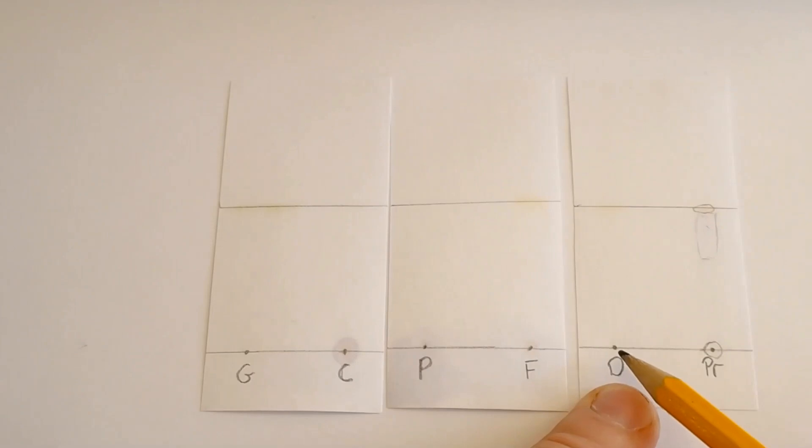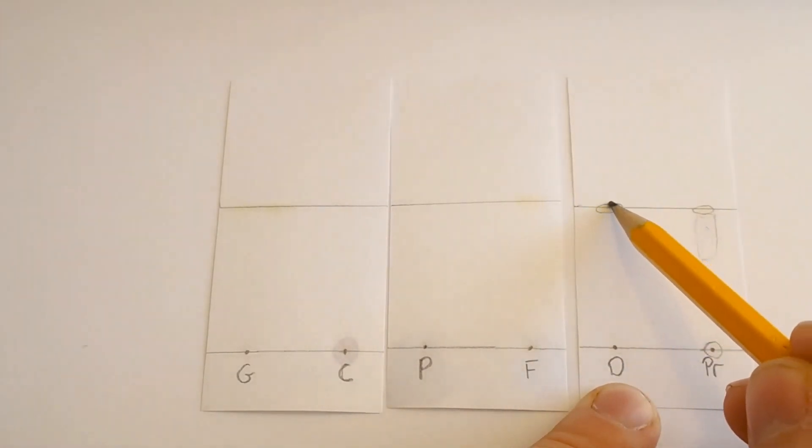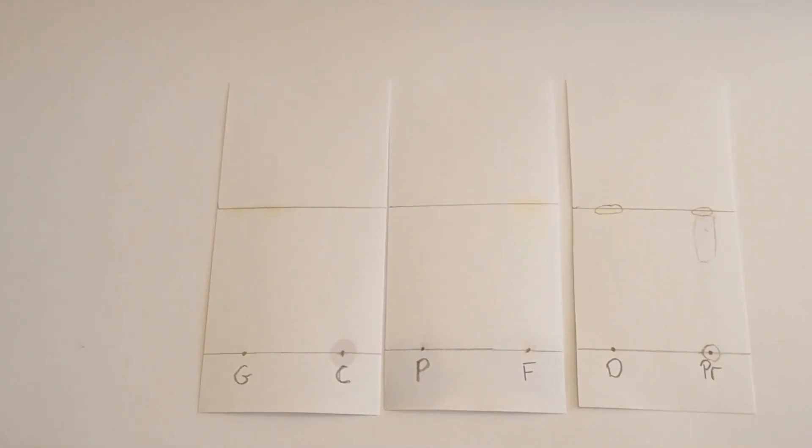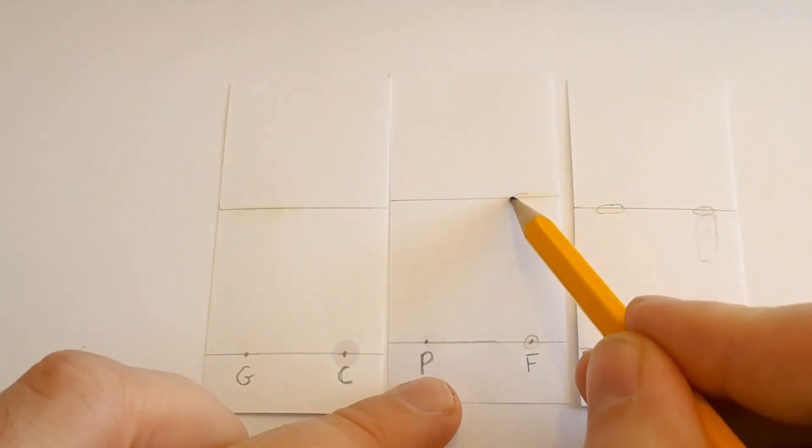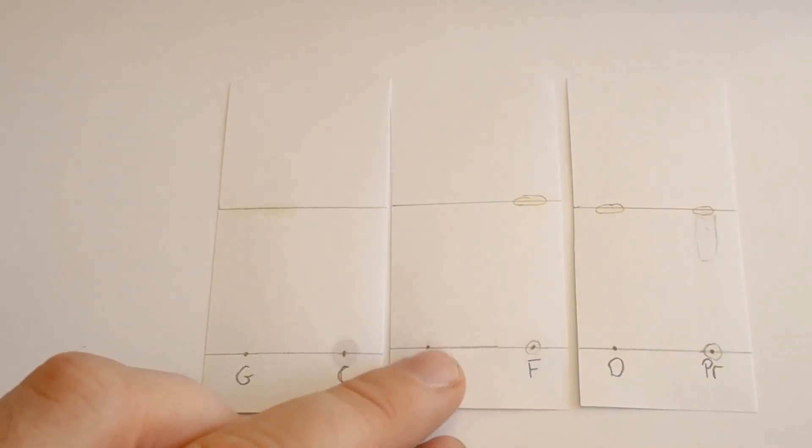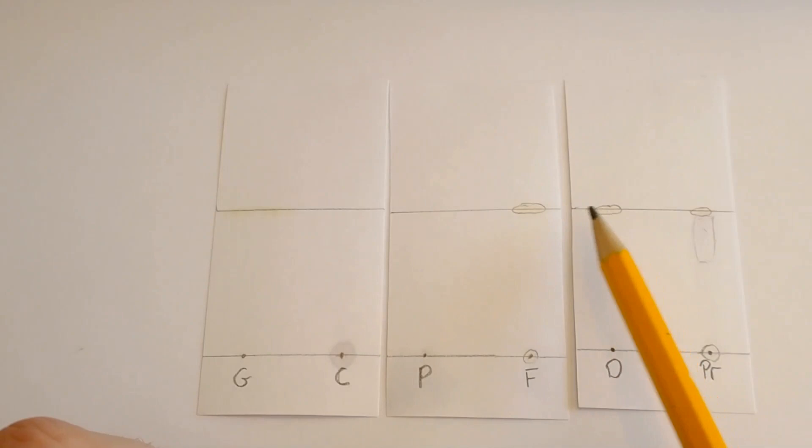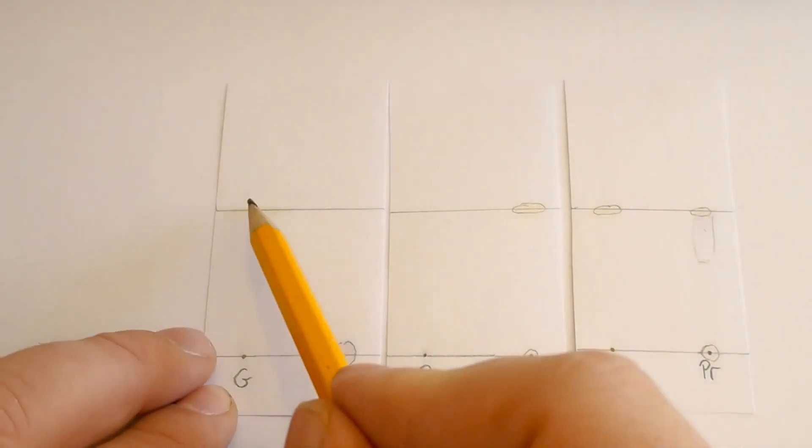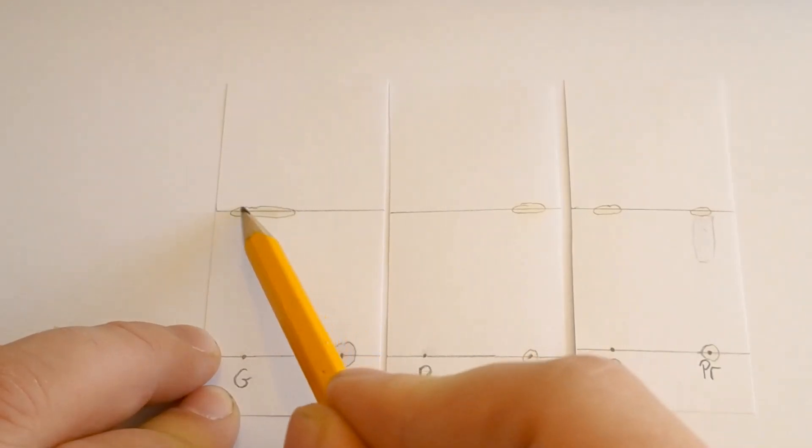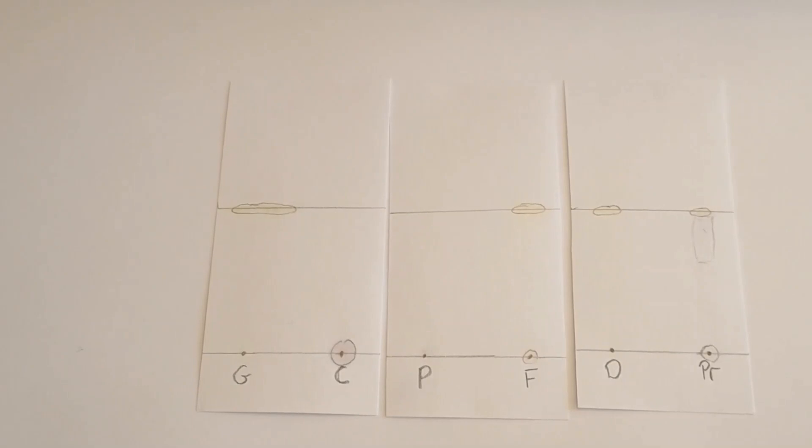On the daffodil, I can't see anything down here. In fact, all I can see is some yellow up there. With the forsythia, I can see a little bit of orange down here and a little bit of yellow up here. It's interesting, isn't it? These two compounds travel with the solvent. Now I can't see anything on here, but it was very difficult to see anyway, wasn't it? And then we've got this one here, that didn't move at all. It was like the one with velcro on, with the woolly socks around the velcro. It couldn't move very far at all. And then the greenish colours all the way up there. And it's a big mark because I did too big of a spot, didn't I?